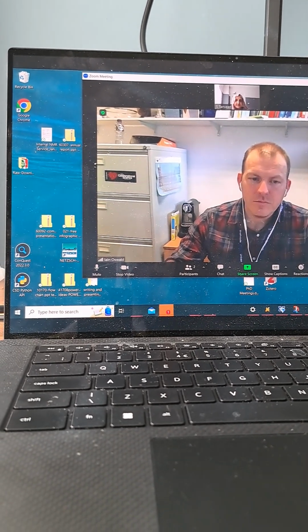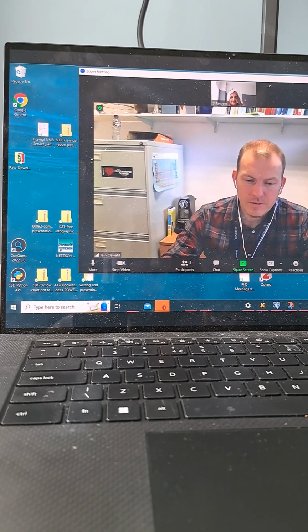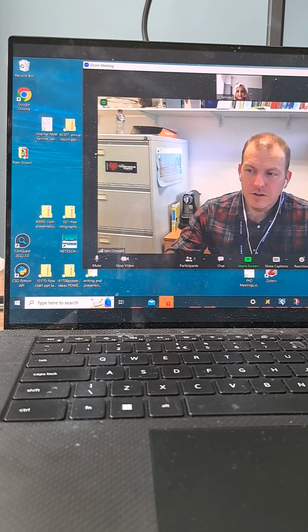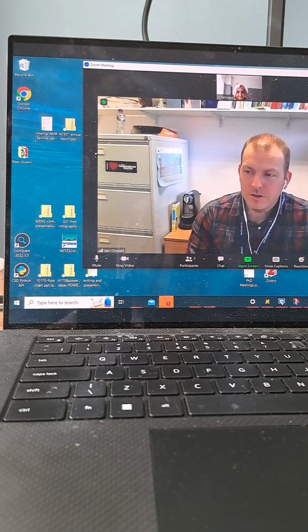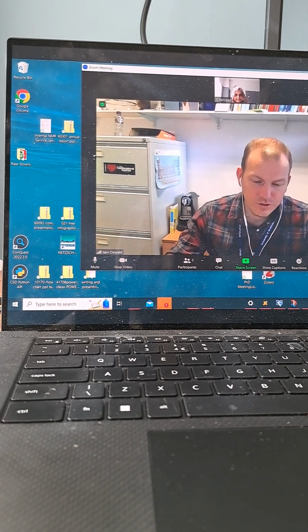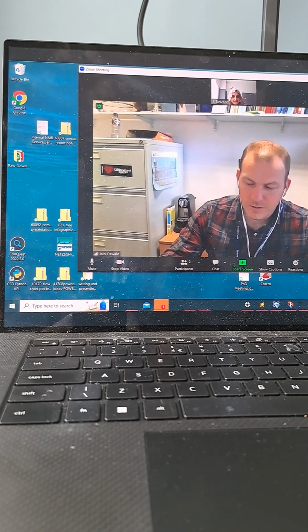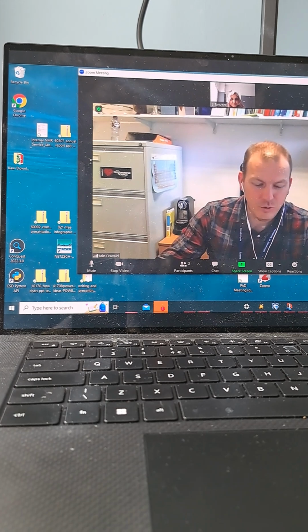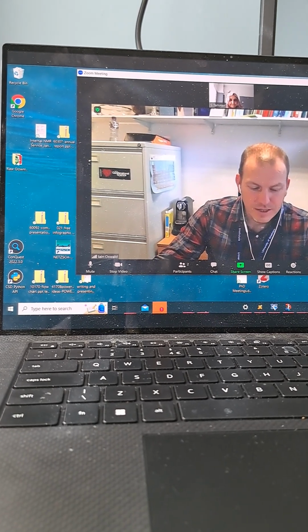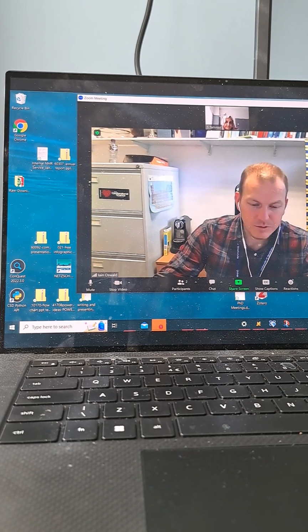Yeah. And sorry for all this. It's fine. You just need to learn how to work the Topas. It's difficult with different computers and different setups. When I say control back or whatever it is, I know that's how you do it, but it's only by doing that you're going to be able to do this.